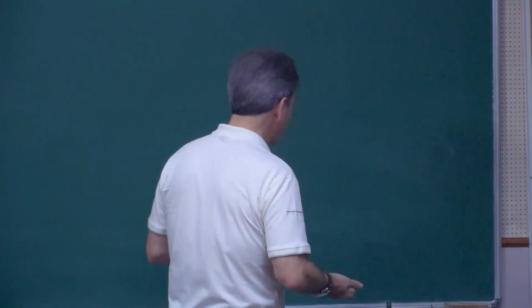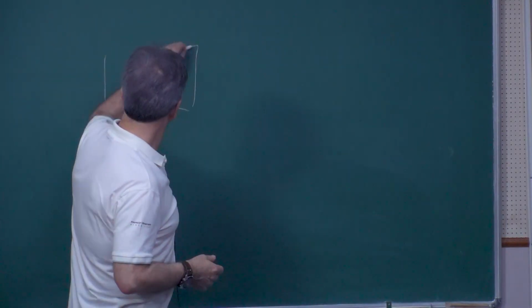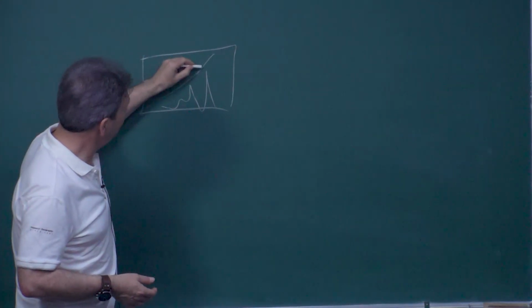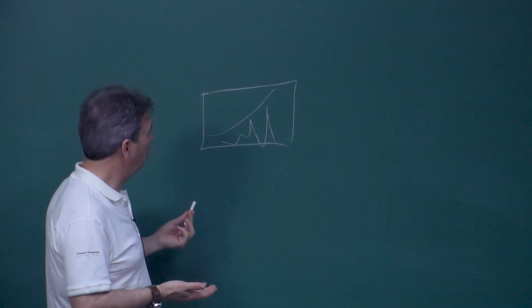So, how does a spectrum with fluorescence look? Well, basically, if your sample has peaks like this, and you have fluorescence, the spectrum will look like that, and you don't even see the peaks. So how do you handle that?